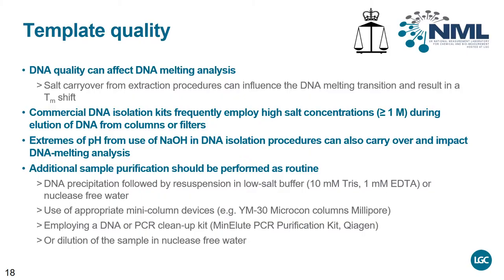Precipitation of the template DNA using sodium acetate and ethanol, followed by the washing of the pellet with 70% ethanol and resuspension in nuclease-free water or low-salt buffer are generally recommended. Alternatively, template DNA can be desalted using a microcentrifugation device, such as a Millipore YM30 microcentrifugation column.